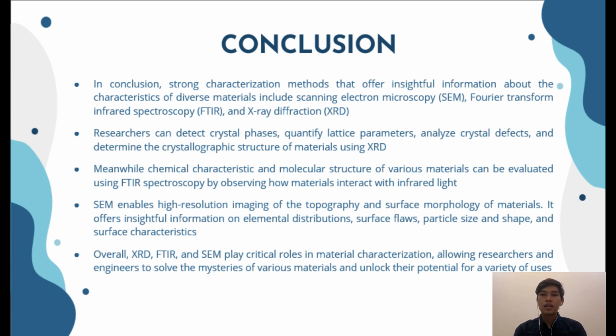Overall, XRD, FTIR, and SEM play critical roles in material characterization, allowing researchers and engineers to solve the mysteries of various materials and unlock their potential for a variety of uses.